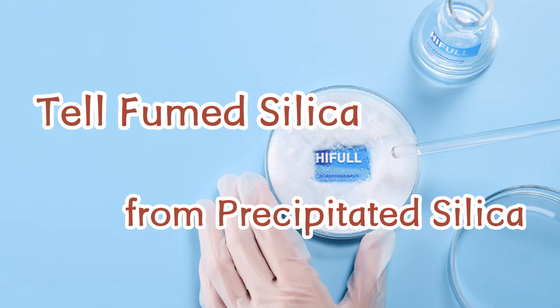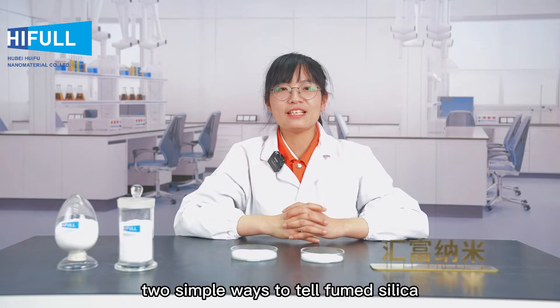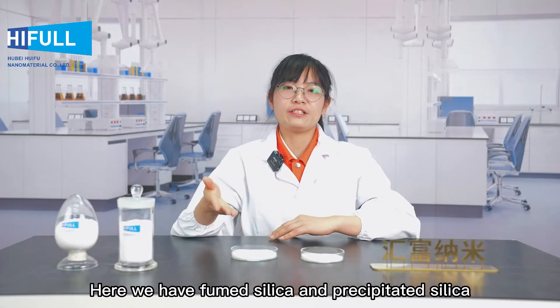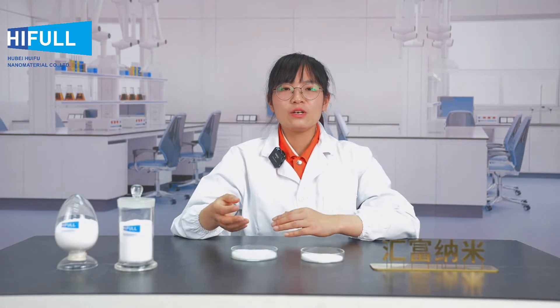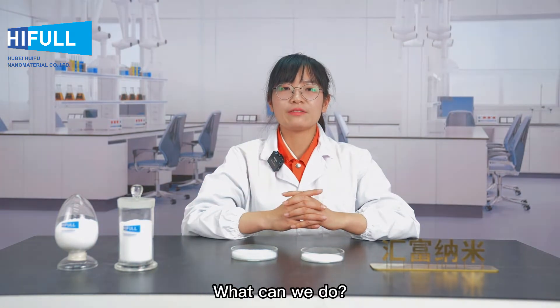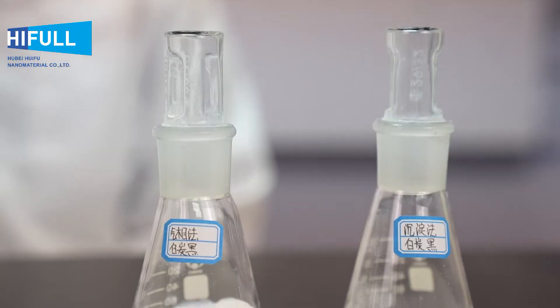How to tell fumed silica from precipitated silica. Hi everyone, today Hyphel will show you two simple ways to tell fumed silica from precipitated silica. Here we have fumed silica and precipitated silica in front of us. We will find it's difficult to distinguish them just by their appearance.